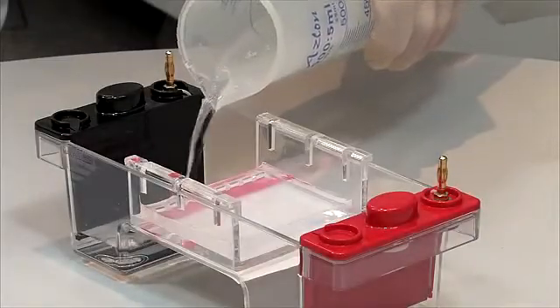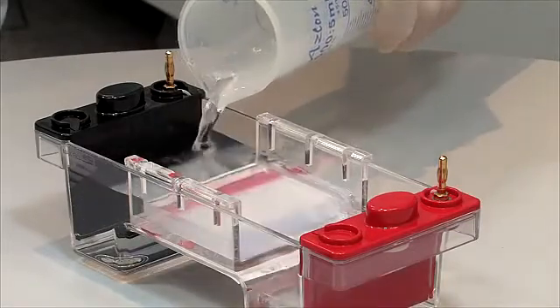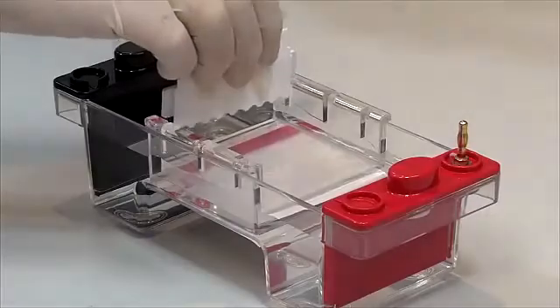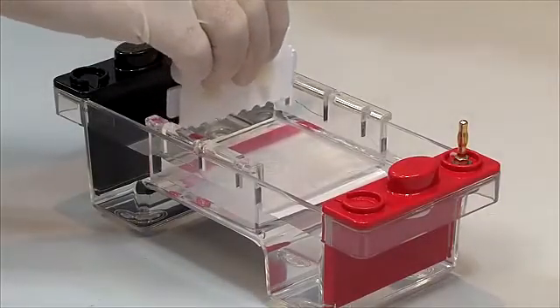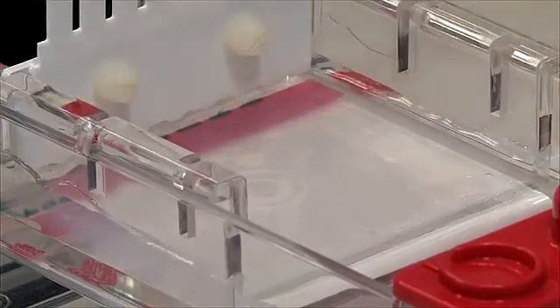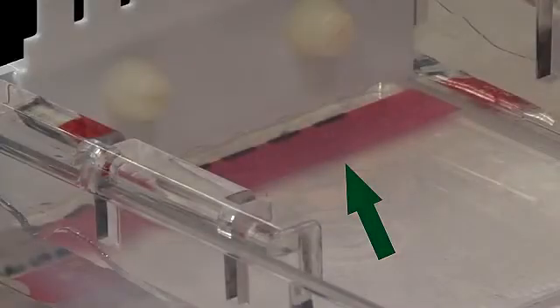Pour just enough buffer to cover the gel and fill the wells. Each comb may be turned upside down and reinserted into the tray to provide a convenient loading template. The red tape on the underside of the tray or on the gel tank platform helps with well detection.